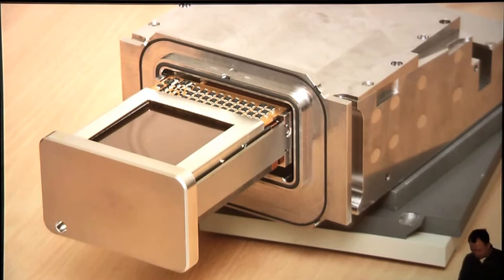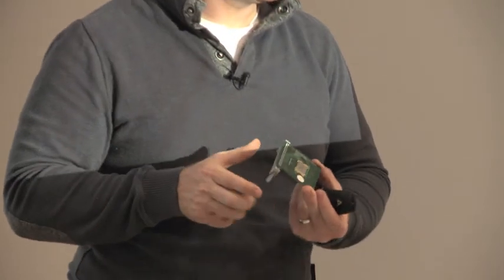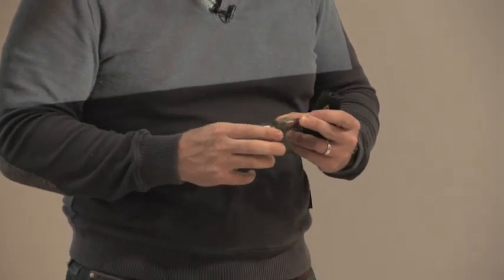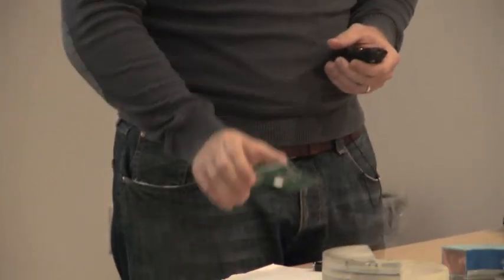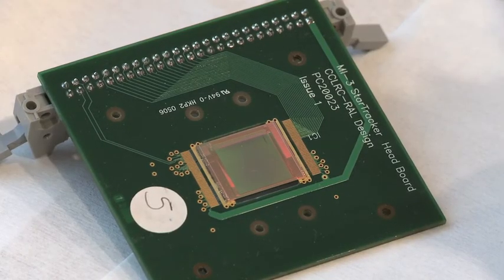Greg was kind enough to give me one of the prototypes, which you can again come and see afterwards. It's a bit smaller. The real one is 6 centimeters on the side, so it's almost the size of this whole printed circuit board, but the actual chip is right here. So you can see what these things look like, and they really were developed here, and it's very exciting to be a part of this new technology.